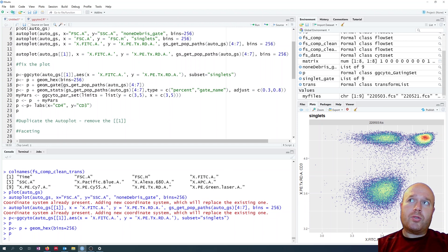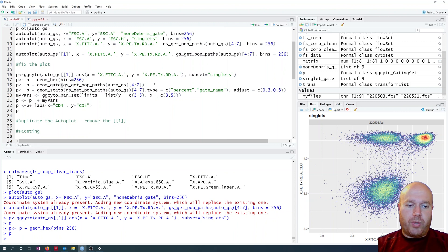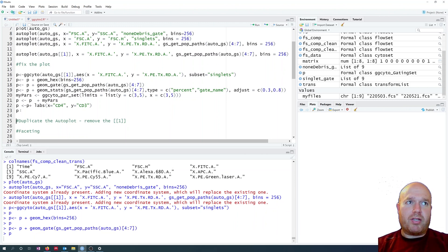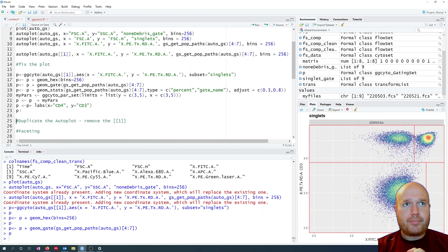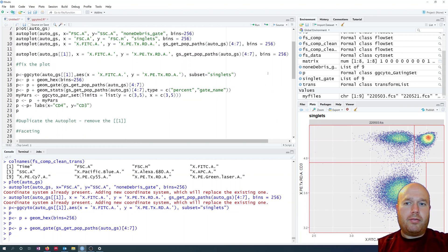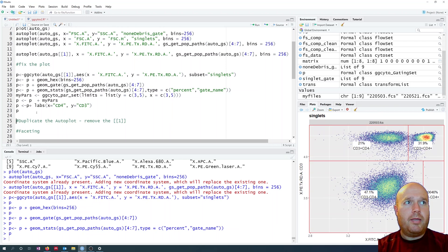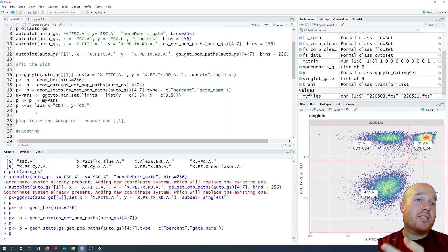I can add some gating using geom_gate, passing the gating set and getting population paths 4 to 7 — I know it's 4 to 7 from the previous video. geom_gate is the ggcyto function for finding gates. Now if I press P I should see a gate appear. Fantastic. I also want to add statistics using geom_stats, getting the same paths and choosing percentage and gate name. Now we've got percentage labels on the gates, which is fantastic.